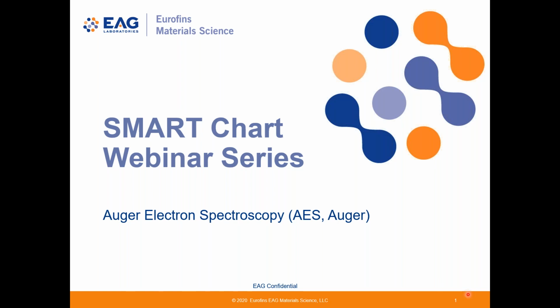Welcome to another of a series of webinars dedicated to exploring the Smart Chart, which is a descriptive graphic that shows the capabilities of all the techniques we offer in one figure. Today, we are going to explore one of the most useful of all the techniques, Auger electron spectroscopy, also known by the acronym AES, or just plain Auger.